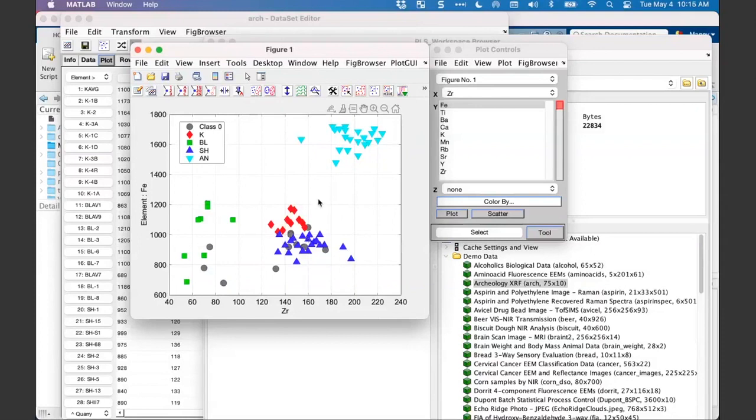So we have one thing that also happens often. You don't see it in this data set because it's not as populated, but sometimes when you have thousands of samples, it gets hard to see where is what, and you will have classes that are behind others. So one thing that you can do is just go for one member of that class, and that will bring that class to the front. You can see that immediately it highlights it, and it shows you a label. And as you can see, you can always move the labels around, which is super convenient.